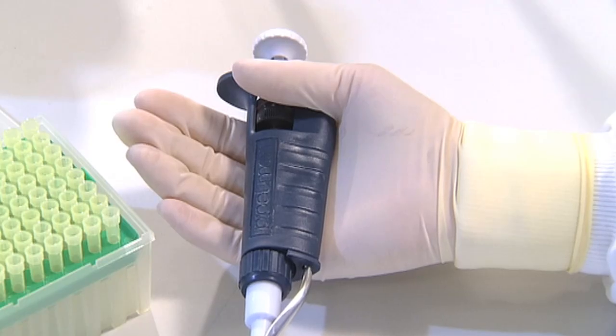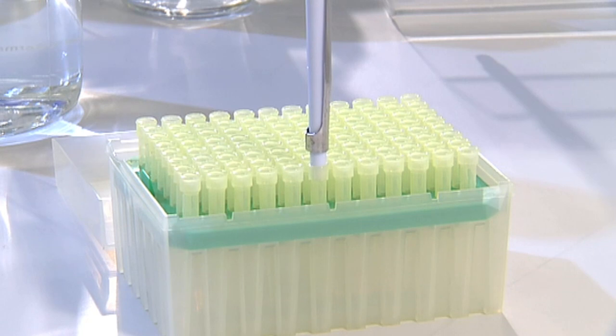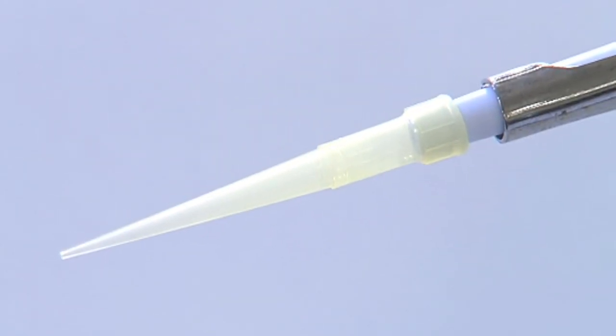Hold the pipette with one hand with the narrow side resting in the palm of the hand. Add the pipette tip by gently but firmly pushing the pipette into the pipette tip, which is held in a tip box. You may need a little practice to apply the right amount of pressure to give a good airtight seal between the tip and the pipette.